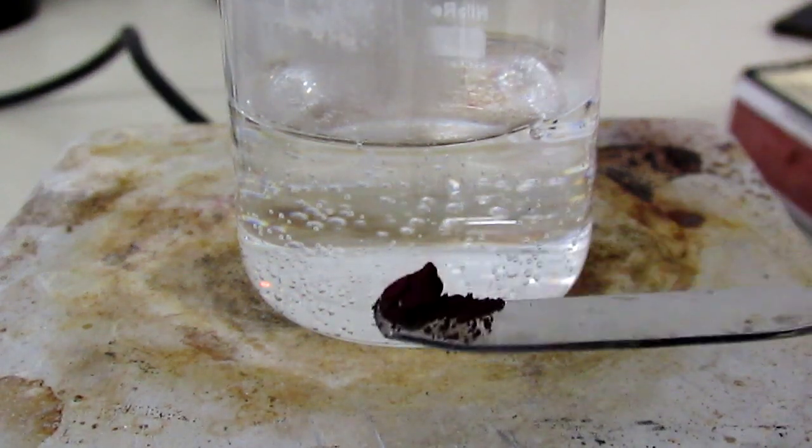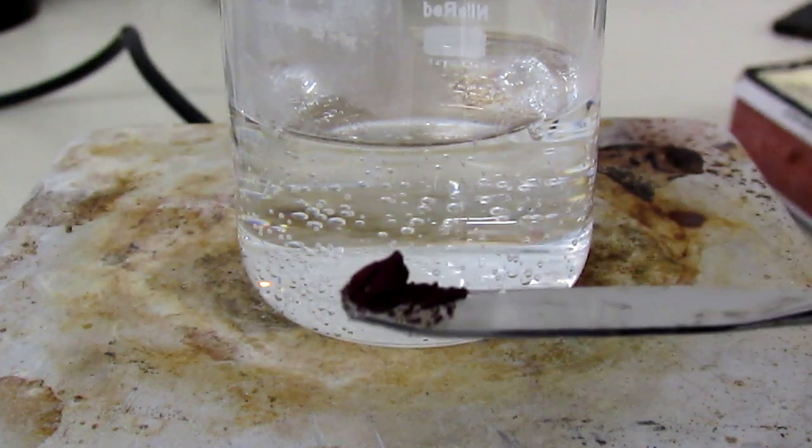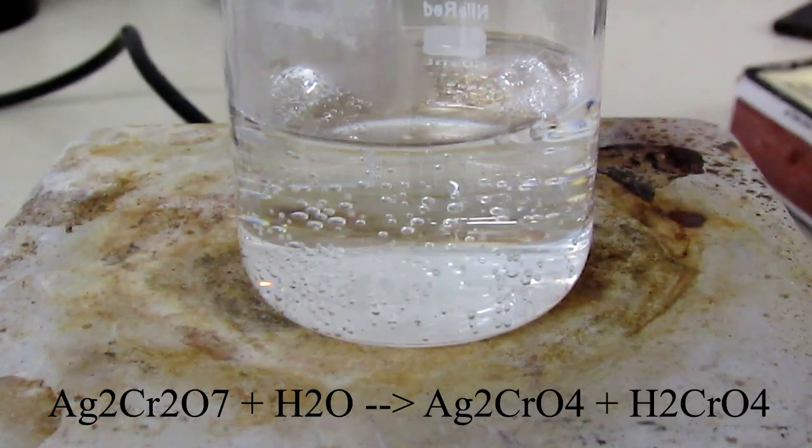One thing to note is that if you add silver dichromate to boiling water, it will decompose into silver chromate and chromic acid.